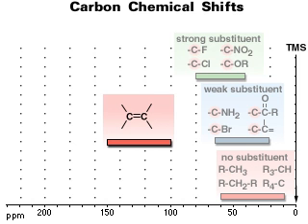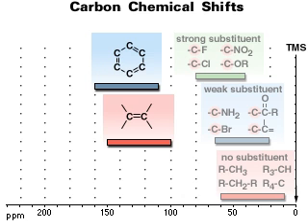sp2 hybridized alkene and aromatic carbons can easily be distinguished from aliphatic carbons due to their higher resonance frequency. Again, neighboring carbon atoms and substituents influence the chemical shift in a complex manner. In molecules with triple bonds, the induced local magnetic field shields the carbons, leading to a lower resonance frequency.